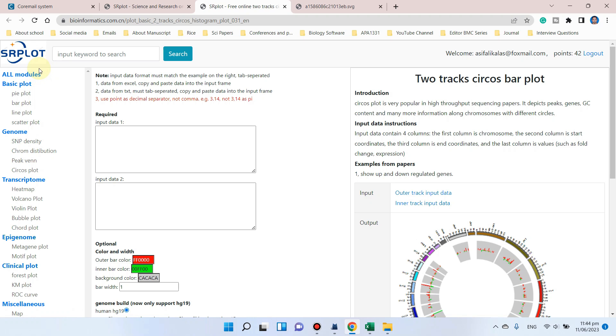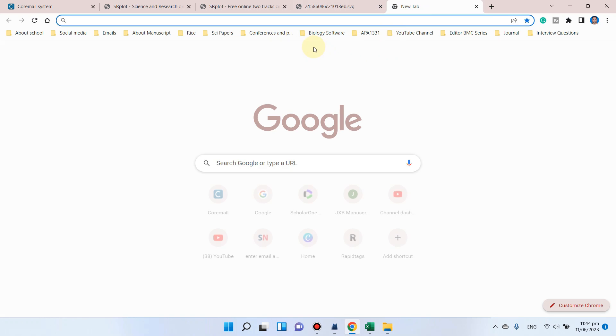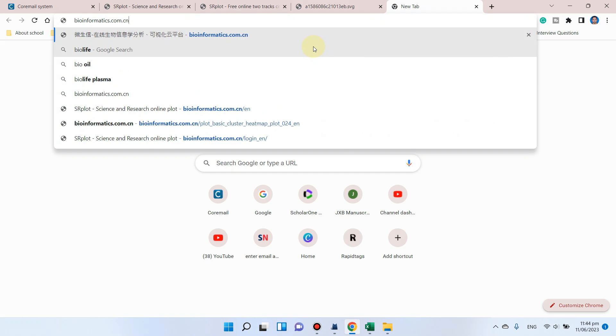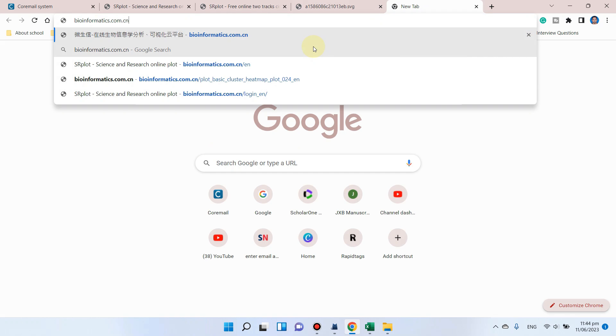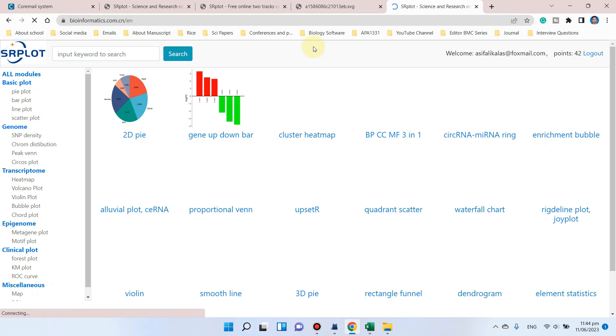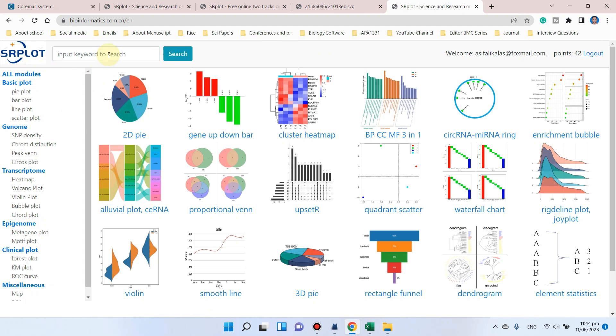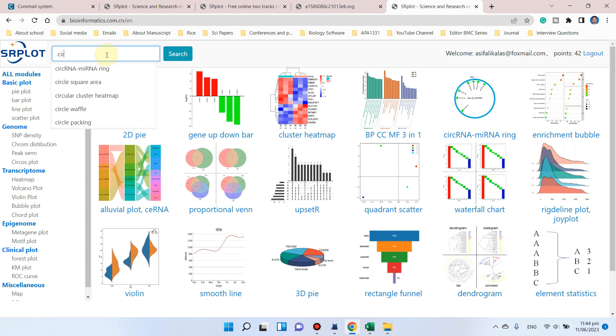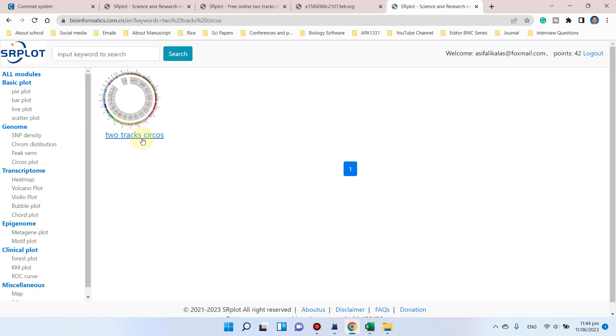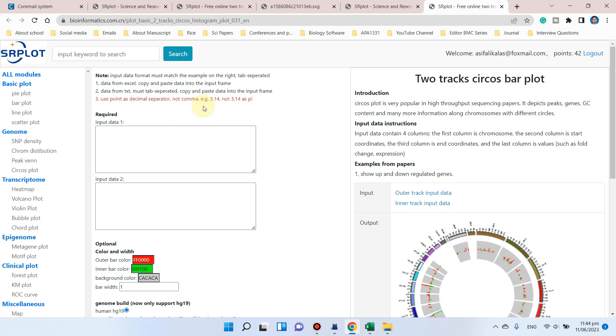First, let me show you how to approach this website. You just need to write bioinformatics.com.cn/en, which will take you to this website. Here you can write 'circos,' and you can see the two-track circos option is available. When you click on this, it will take you to this panel.